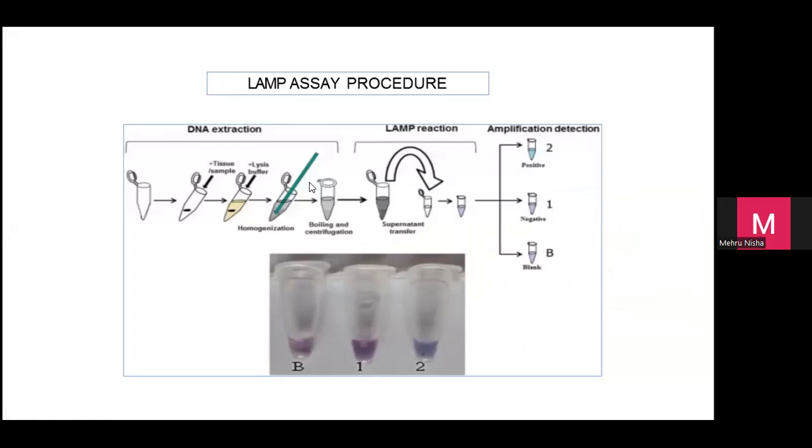Okay, you do a DNA extraction. Okay, tissue sample, lysis buffer. We mix it on the spot. Okay, then you put the enzyme. Okay, kalau dia tukar, yang ni kalau dia tukar macam biru, it's positive. This one negative and this one control.